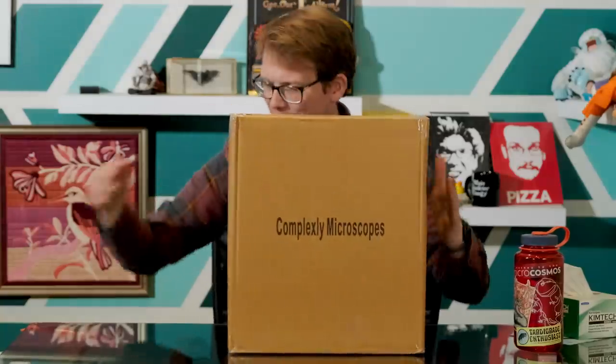When I first started getting interested in microscopy, it was very intimidating for me to try and figure out what microscope to get. So I'm really happy that we at Journey to the Microcosmos are able to provide the thing that we think is the best thing to get you started. I'm going to put it on the desk here — there it is. This is what it will arrive looking like.